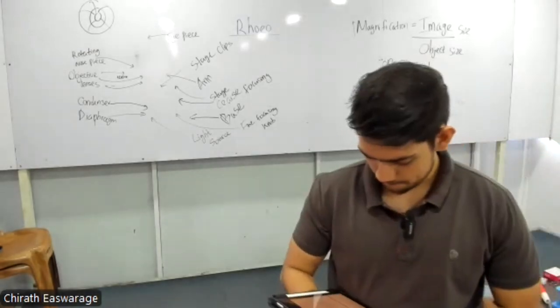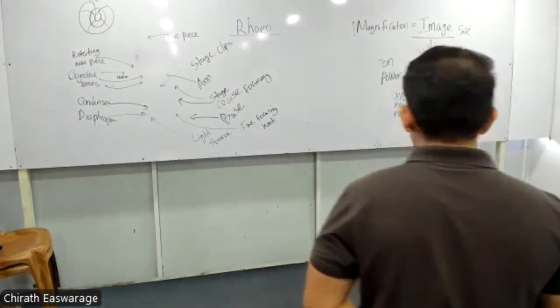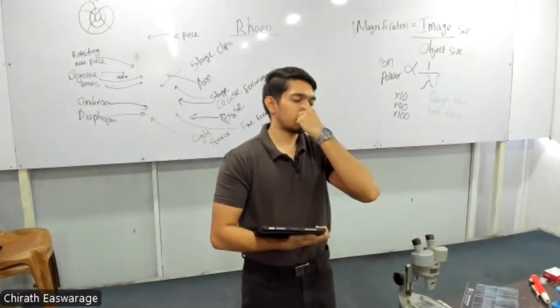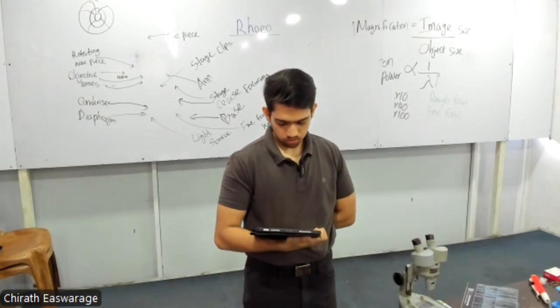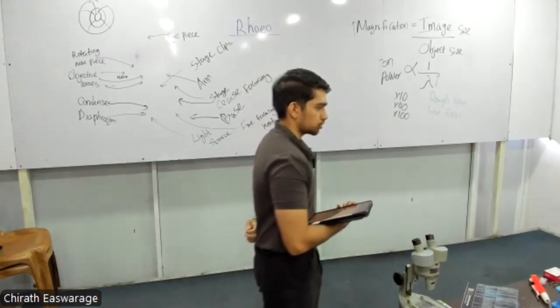Online students, also write down. Transfer the onion piece into a drop of water on the center of a clean glass slide using a paintbrush. Transfer the piece of onion peel into a drop of water on the center of a clean glass slide using a paintbrush.